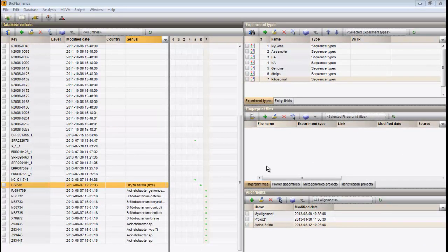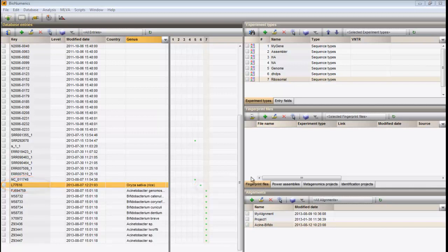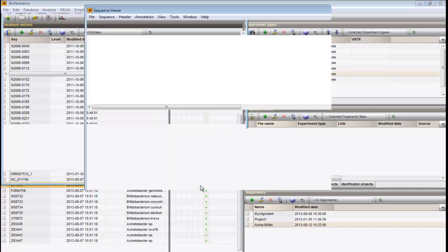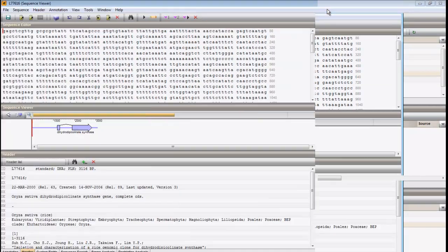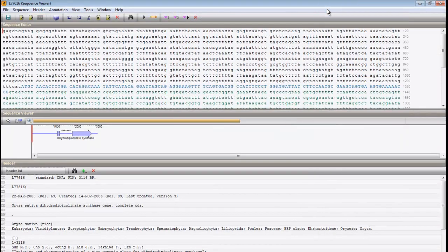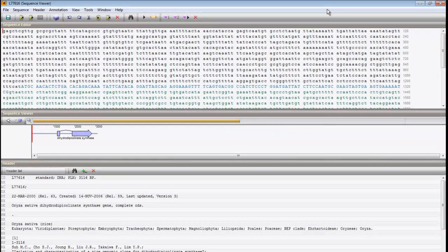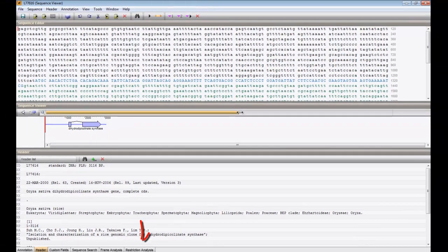Open the Sequence Viewer of a specific entry by clicking on its dot for the sequence type. Select the Restriction Analysis tab in the lower panel.